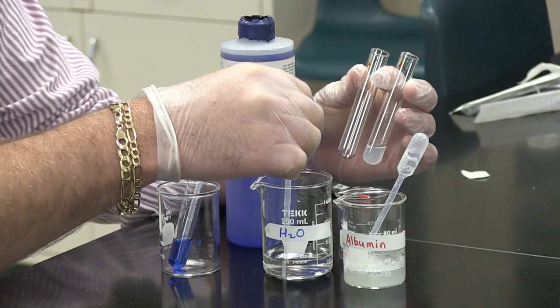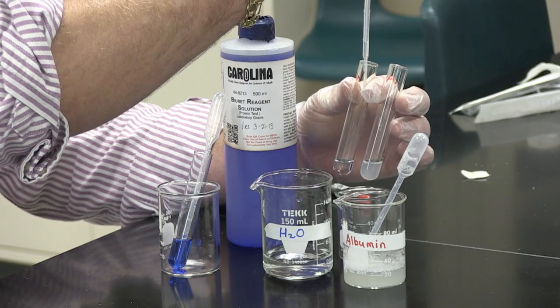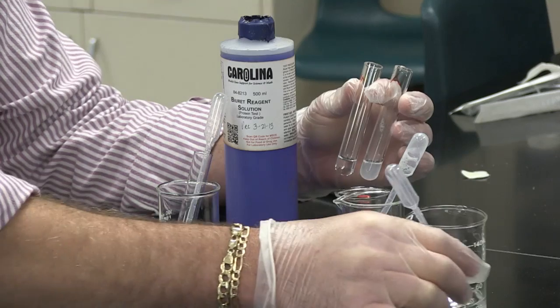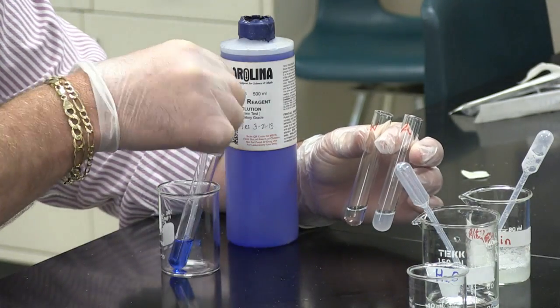In the test tube marked with a W, I am going to put in one dropper full of water. Next, I am going to add the Biuret reagent to each.